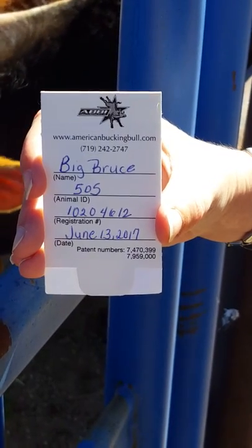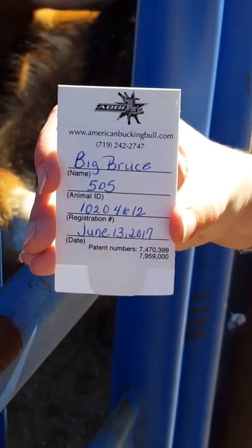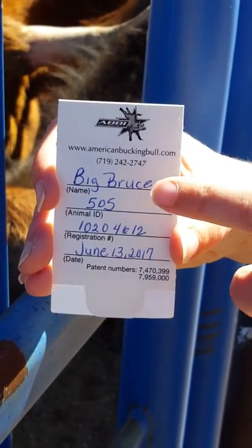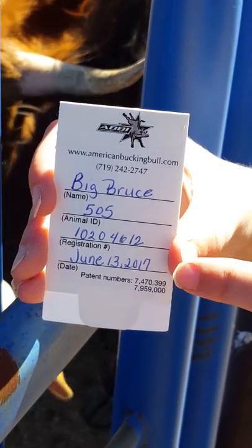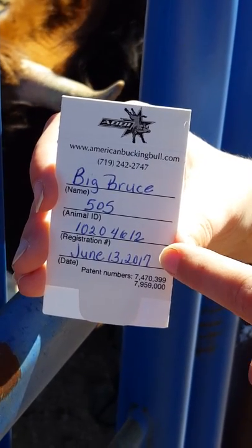This is a short video on how to take tail hair from an animal for ABBI submission. So this is the tail hair card, and as you can see, there's the name of the animal, the brand number of the animal, the registration number — and you'll get the registration number if you submit it online.